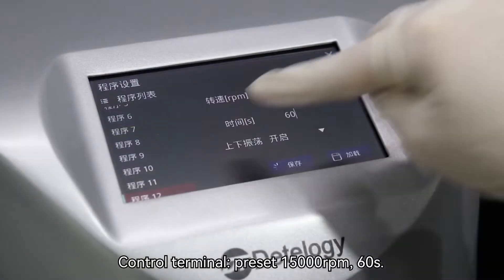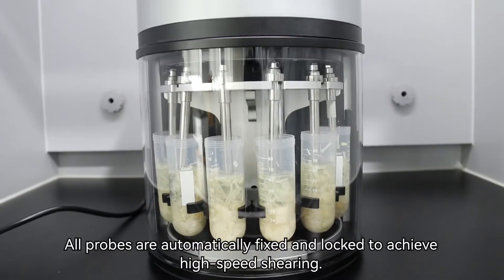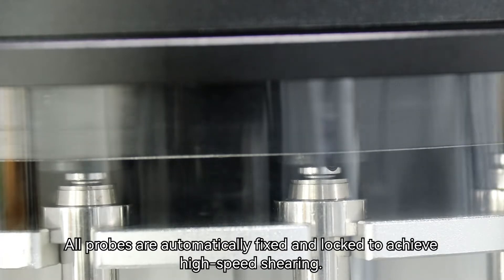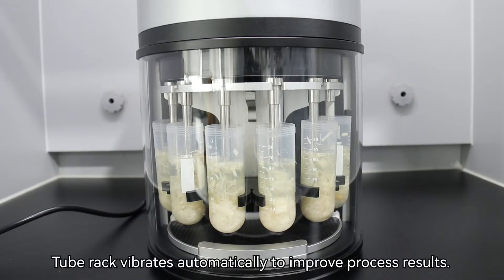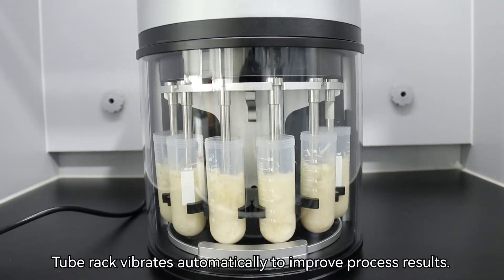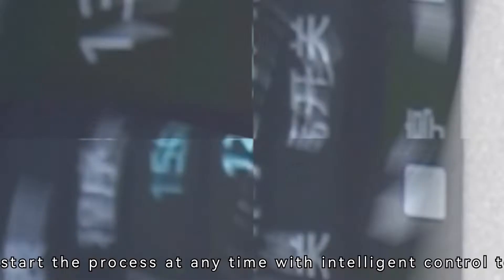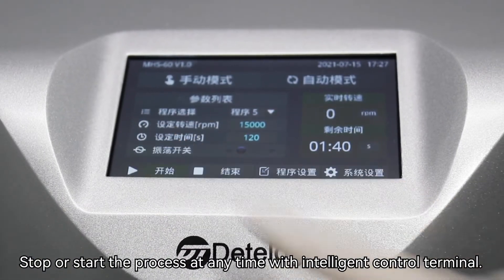Control terminal preset: 15,000 rounds per minute, 60 seconds. All probes are automatically fixed and locked to achieve high-speed shearing. The test tube rack vibrates automatically up and down to improve process results. Stop or start the process at any time with the intelligent control terminal.